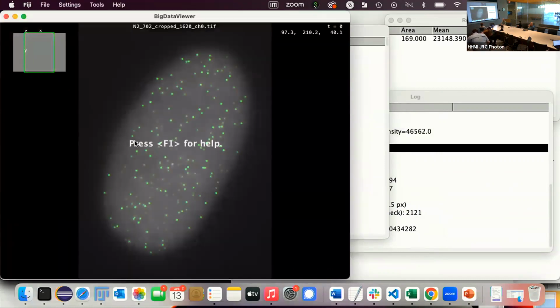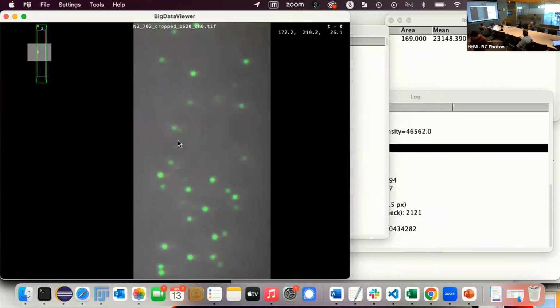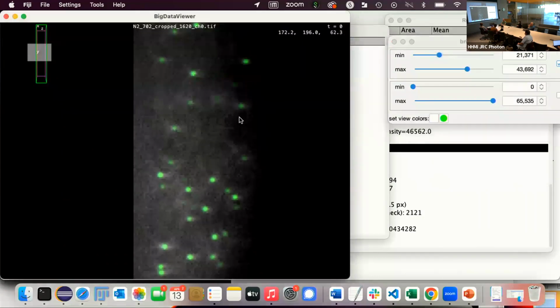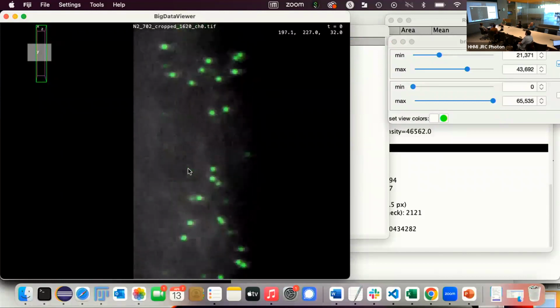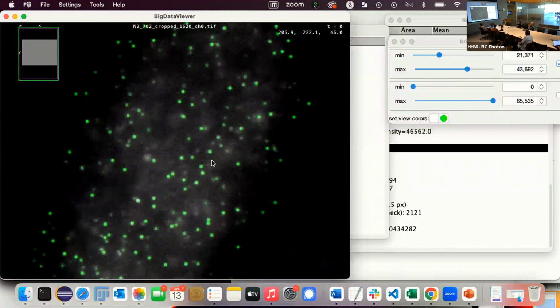And you can look at this in 3D, right? That's the same that you saw for the big EasyFish data set. Nice thing here, you can more easily look at this in 3D. Points are at the right location, if everything was found, or at least you get a good feeling for it, right? You get to live with it and convince yourself. It's plotted as a Gaussian in 3D. That means you see it. The ones that are a bit further away are just dimmer. So that's nice as you go through.